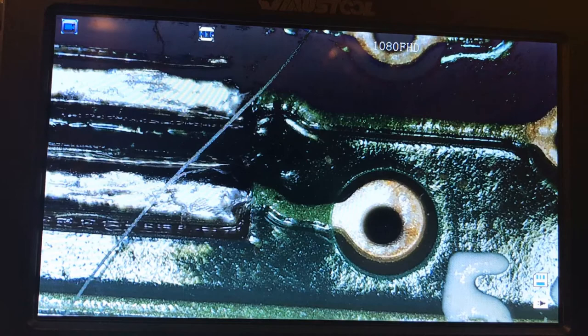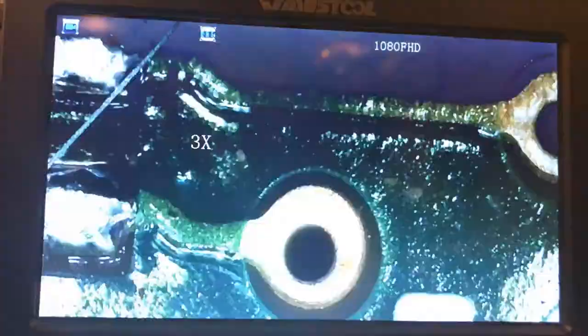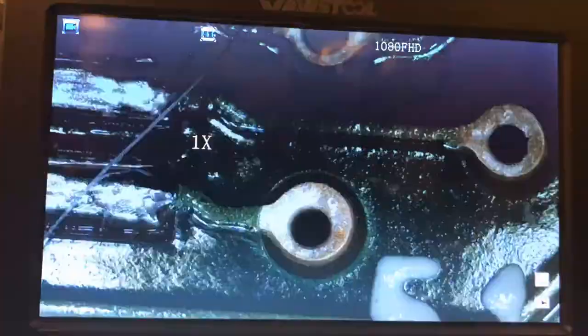A few things I like about this: there is a digital zoom. So if I want to, I can digitally zoom on this thing without having to refocus. It's not the most useful feature, but if there's something you can't quite reach, you don't have to sit there and refocus the whole thing, because it is manual focus.